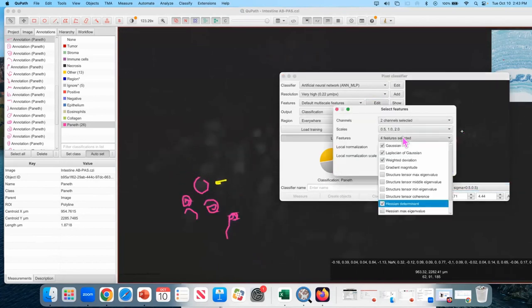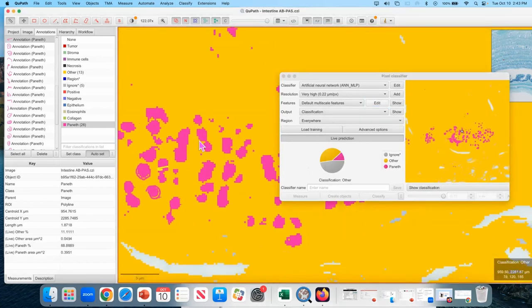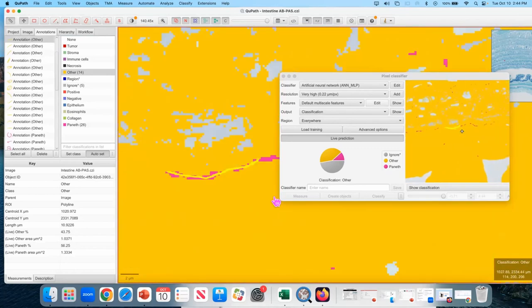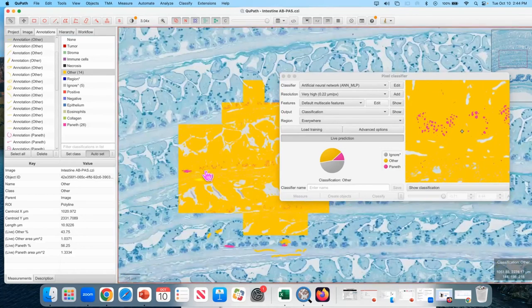So in your object classifier, you can use measurement maps to figure out which features are going to be helpful for a classifier, right? Because then you can visually see that. And here, because it's working on pixels and not objects, you can use those to visually see which of the features will be useful to feed into your classifier.